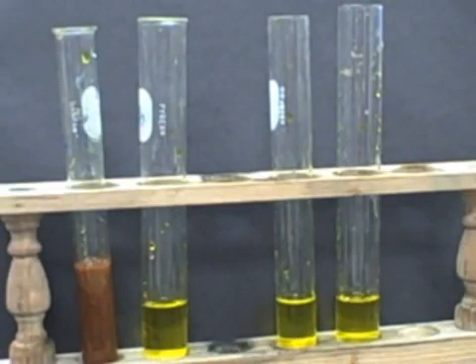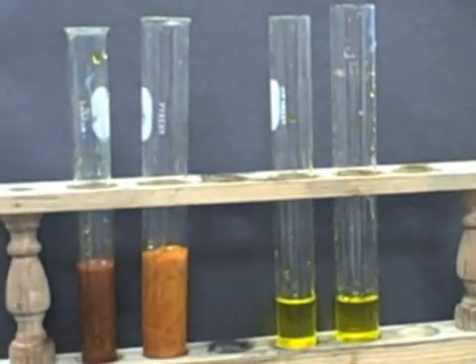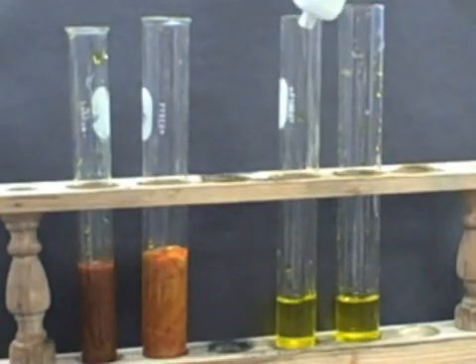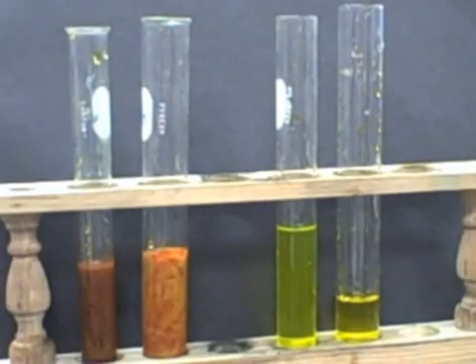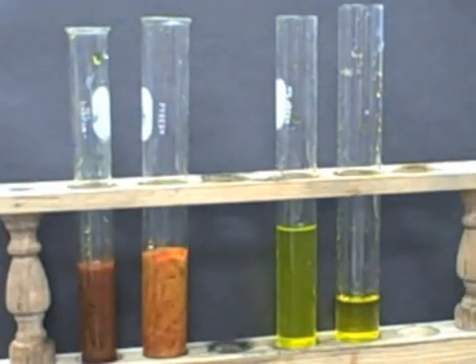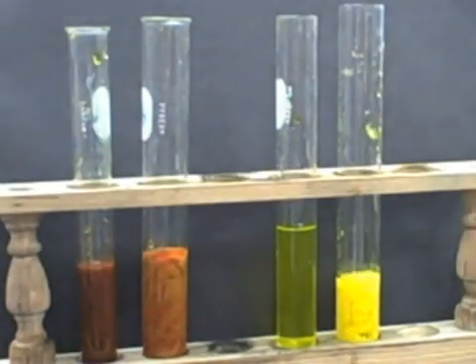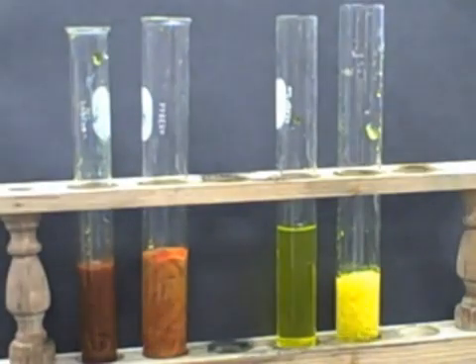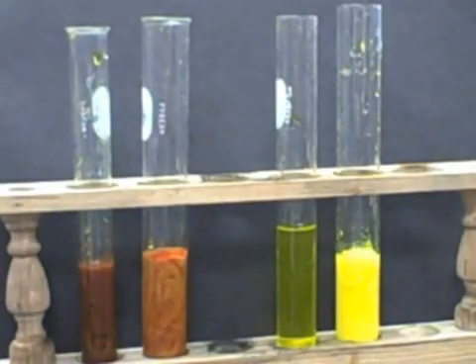And now we're doing iron chromate, so iron chloride in the potassium chromate. Almost the same color, although a little bit more orange. And now we're going to do nickel. Nickel chromate. Actually, I think... No, there's no nickel chromate precipitate. Nickel chromate's probably been made, but it's probably soluble. So that one actually didn't work. And now we're going to do lead chromate. A yellowish color. The yellow is probably just from the chromate, but it is still a yellowish color. So that's lead chromate. So those are chromates.